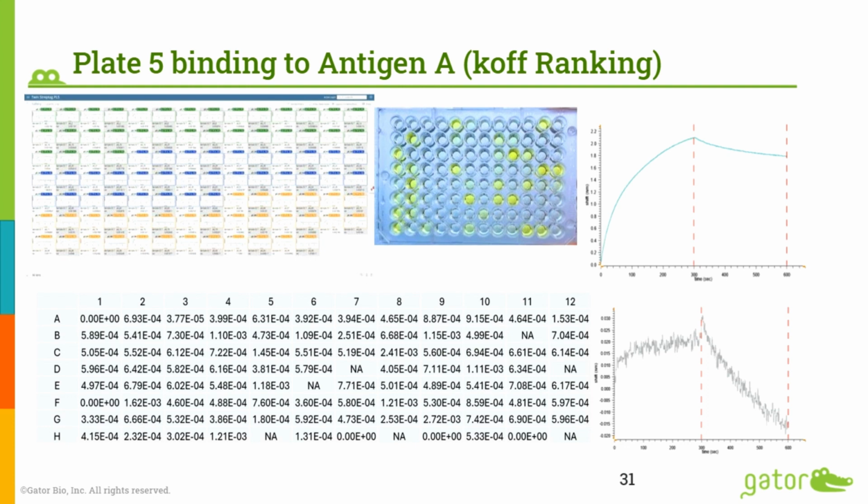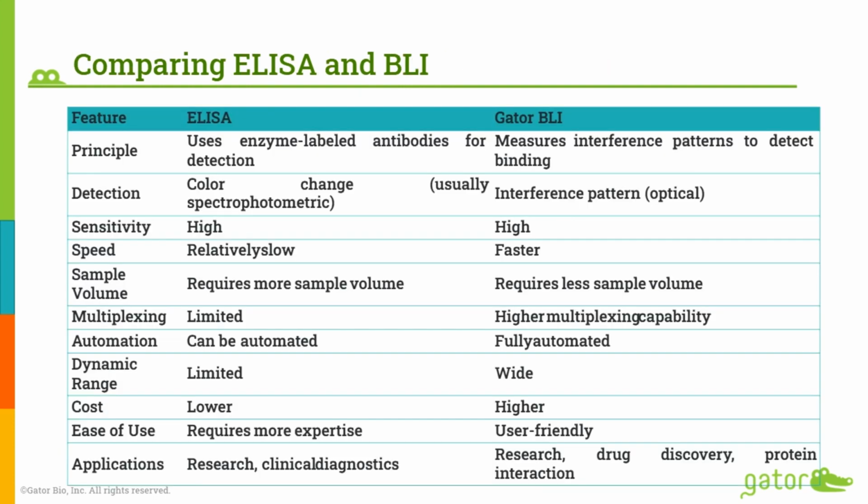But when we compare it with ELISA, of course, you are getting one data point, which is endpoint data. But here we see the entire binding happening in real time. The system is fully automated. And not only do we get a yes and no kind of answer, but we also get to rank in terms of a real dissociation constant, right? I can compare many yes and no, but just for the sake of time, let me move a little bit quickly.